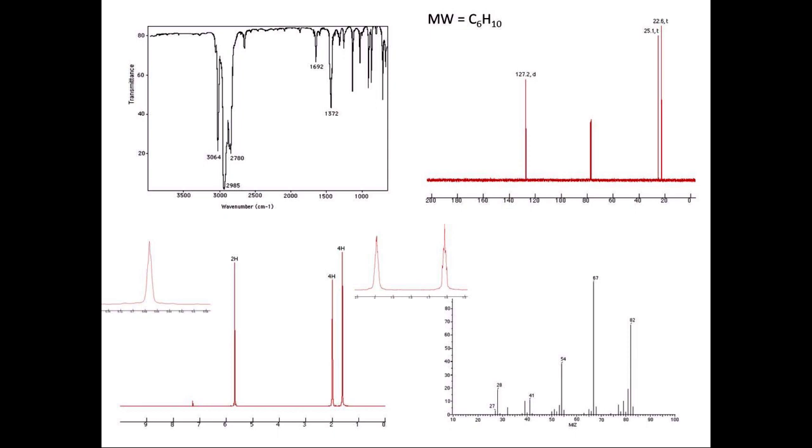Here we could have carbon A, carbon B, carbon C, and carbon D, and carbon D here as well. If we did this molecule, we should see 1, 2, 3, 4. Again, immediately eliminate.